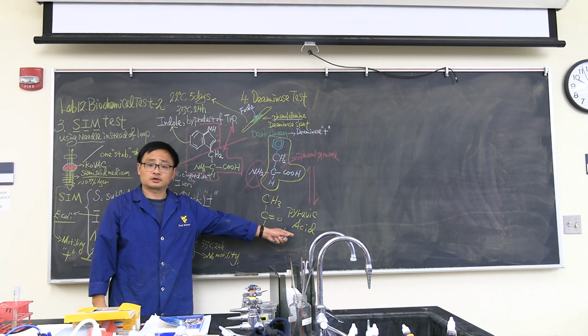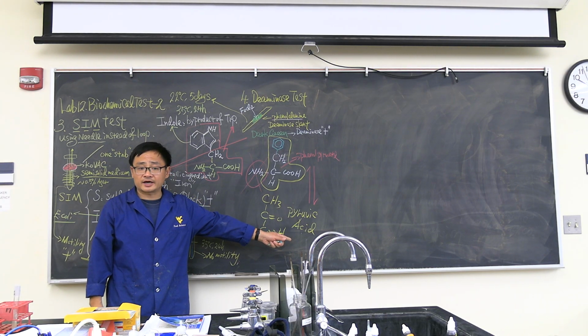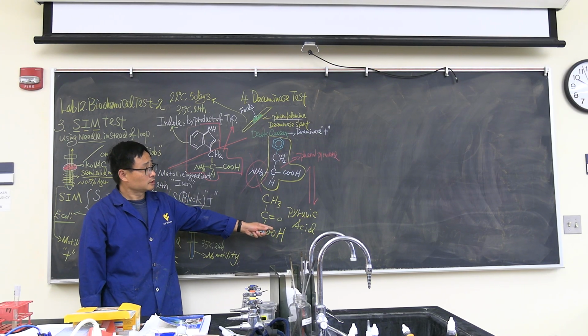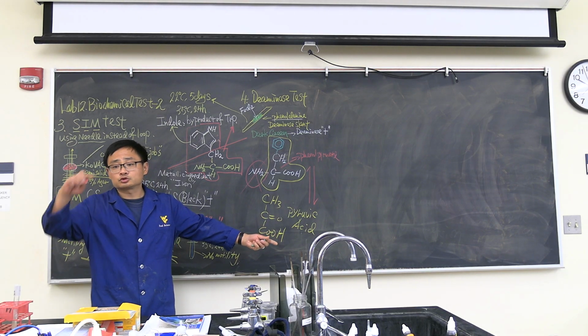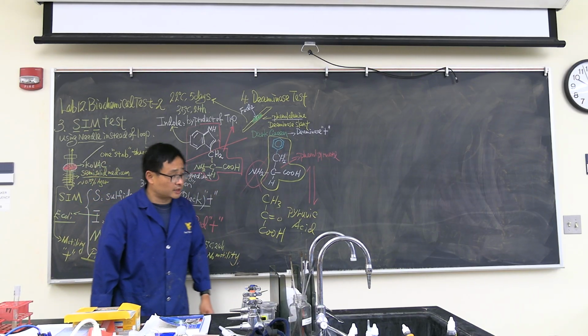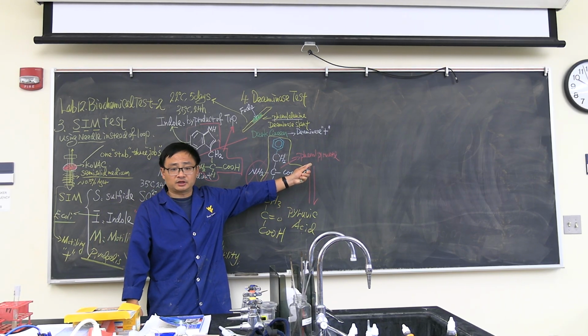What is pyruvic acid? The one after glycolysis. Is that correct? What this means? What means phenylpyruvate? It's a modified pyruvic acid, which means in some environments, bacteria do not use glucose to go through glycolysis. They use amino acids, which is the phenylalanine, and generate the phenylpyruvate. And this is, we call it intermediate metabolic products, or precursor.